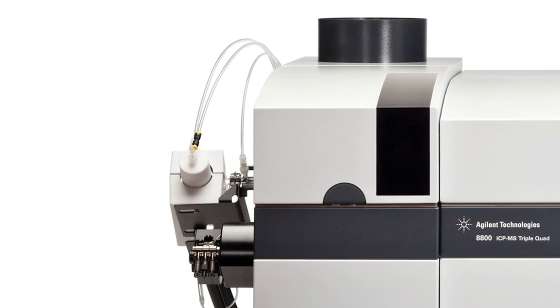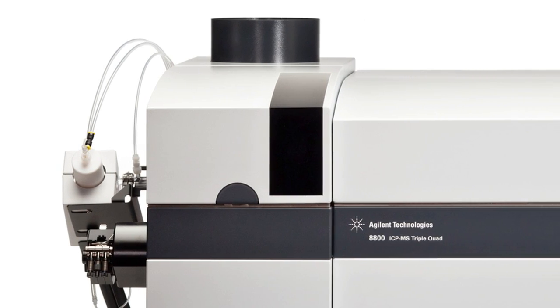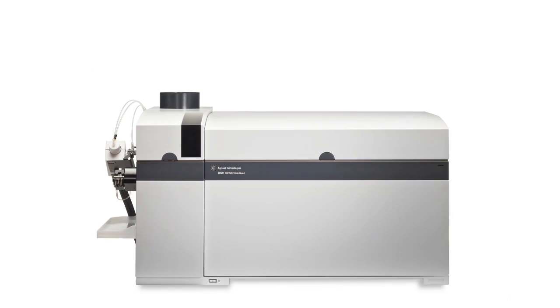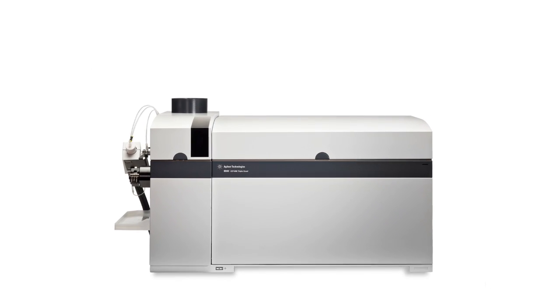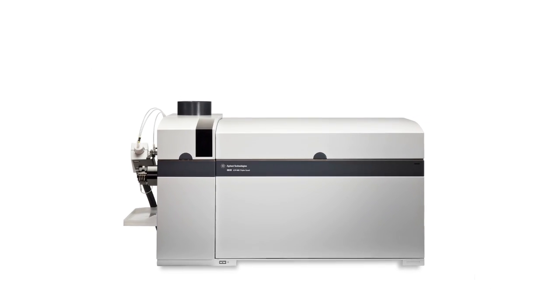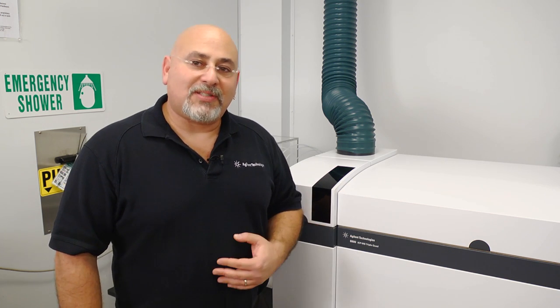Today, we're going to be discussing the Agilent ICP triple quad, the first ICP-MS with MS MS technologies. I will be talking about the hardware, and I will be talking about the MassHunter software part of the instrumentation. The unique and phenomenal capability of the Agilent 8800 ICP triple quad really comes through with its MS MS technology.